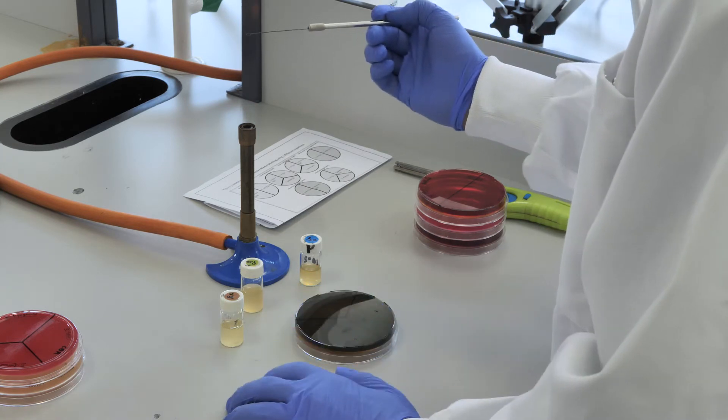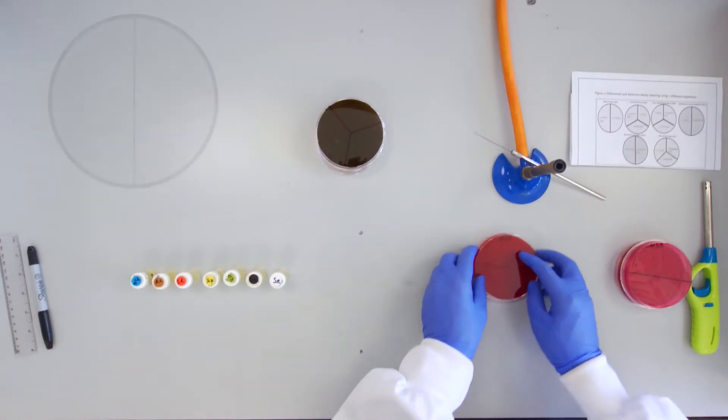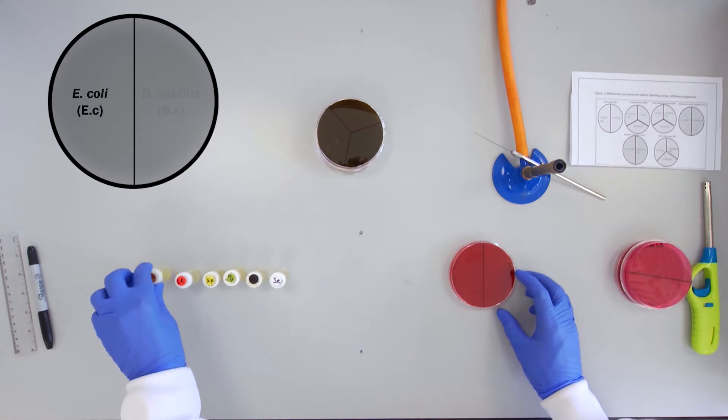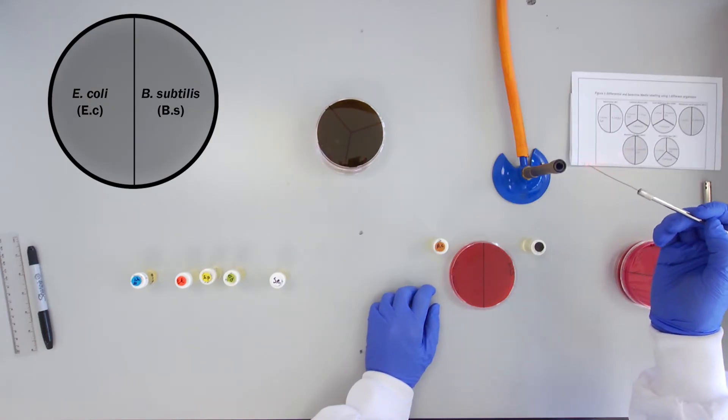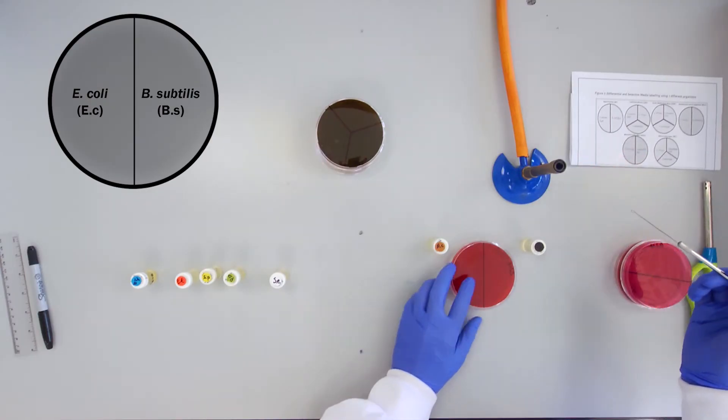The membrane laurel sulfate agar medium or MLSA is a bright red color and will be inoculated with E. coli and Bacillus subtilis.